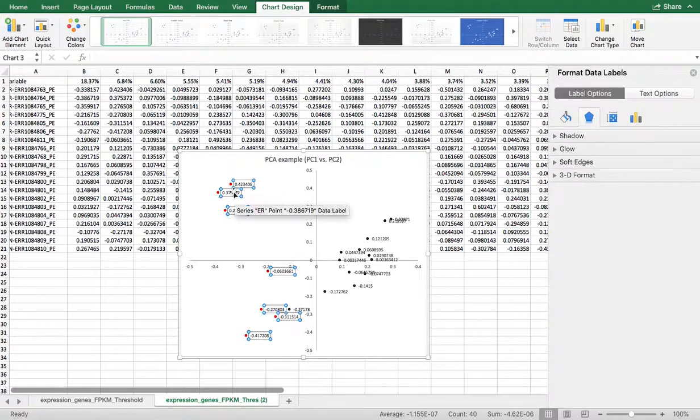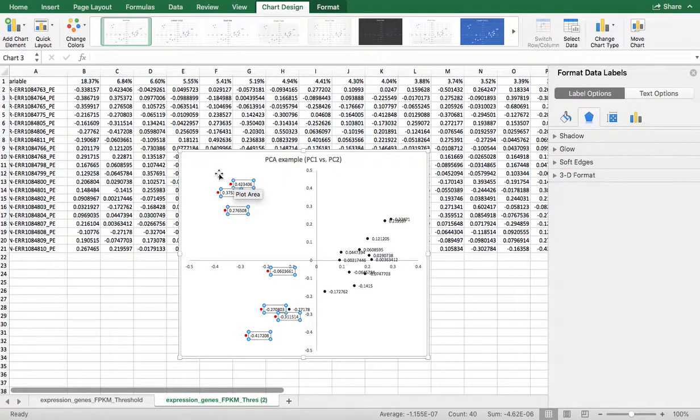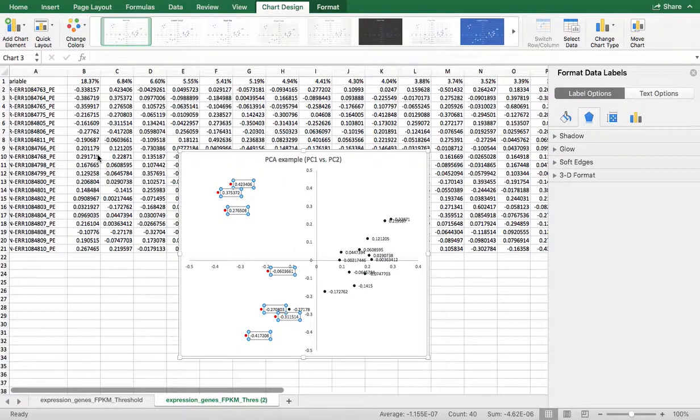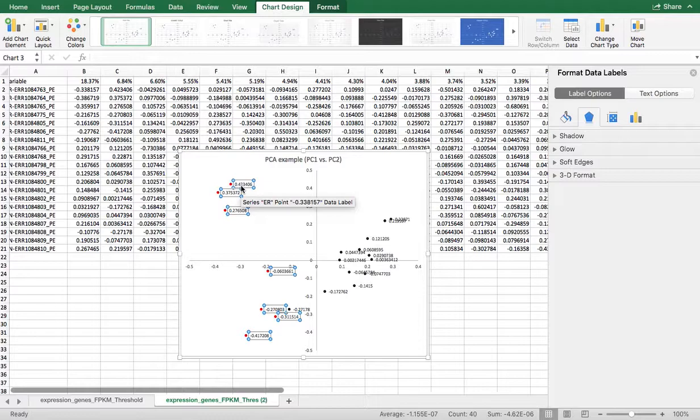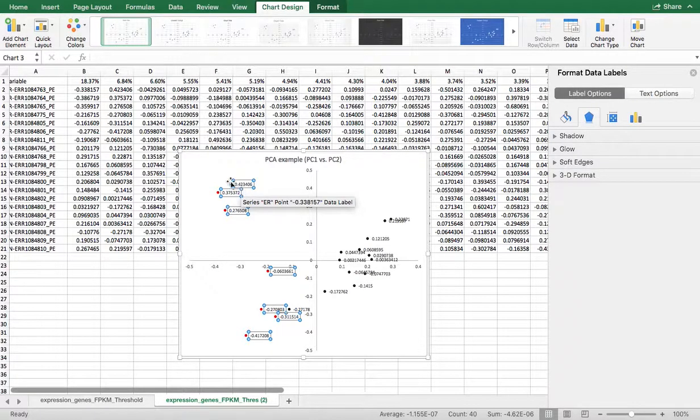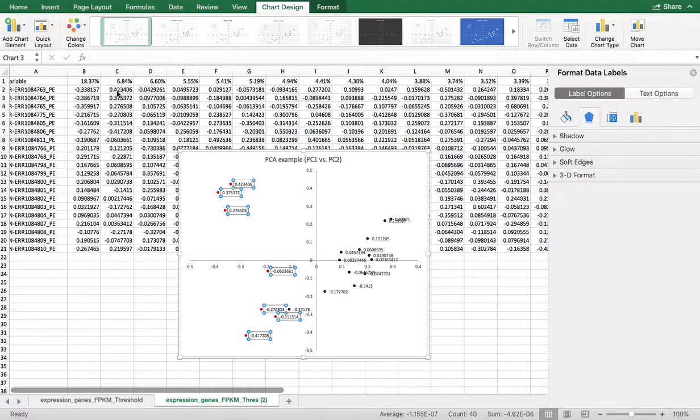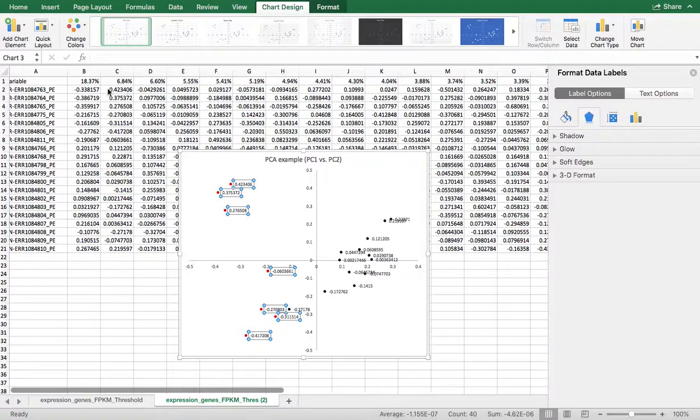Now what is this? 0, 4, 2, 3, 4, and 6. 0, 4. Now this is going to be on the Y label. So it's right here. 0, 4, 2, 3, 4, and 6 is right here. That's this one.